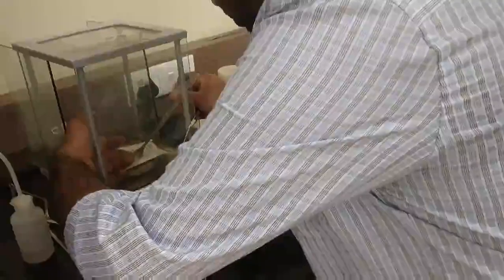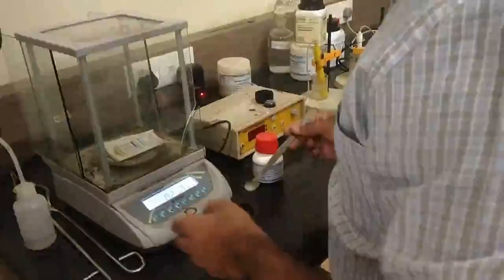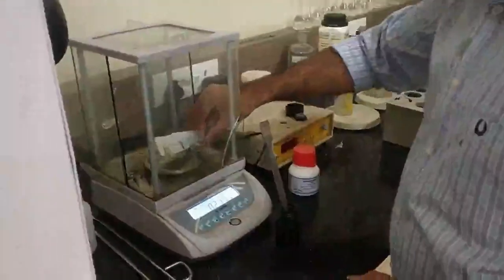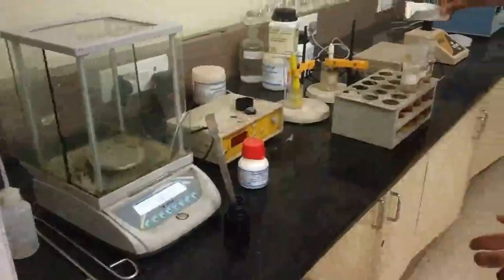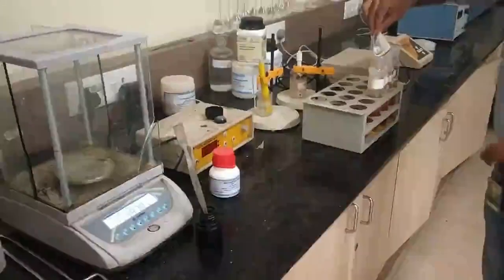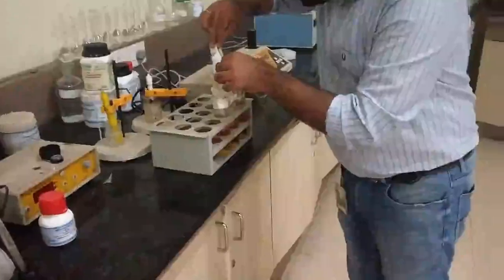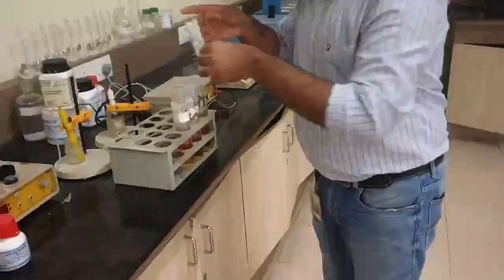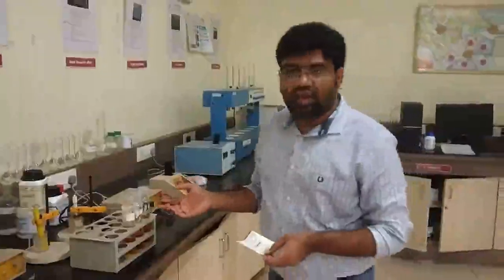It's okay if it is a bit higher, because the quantity is also less. So we are going to add this much into each flask. Same way we are going to add it in the other two flasks as well.